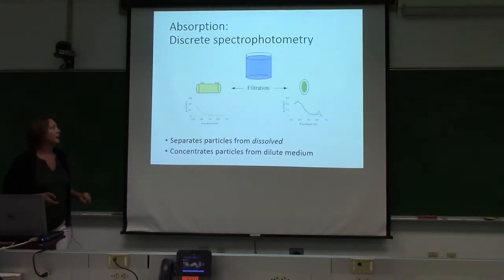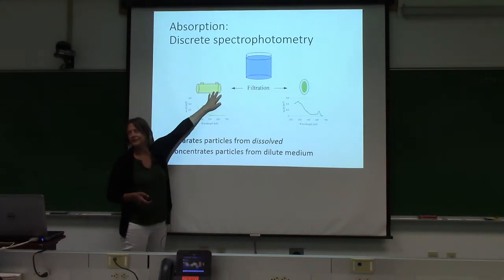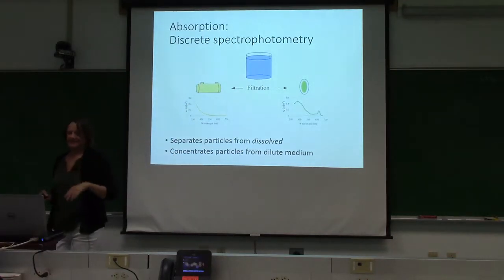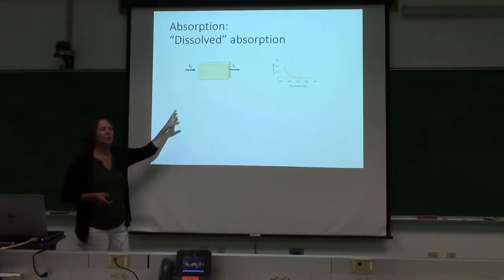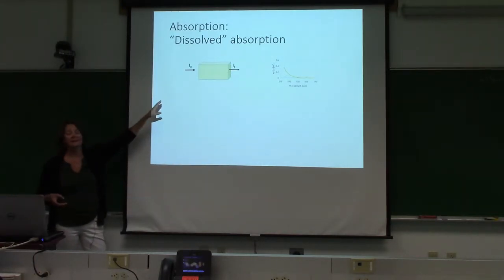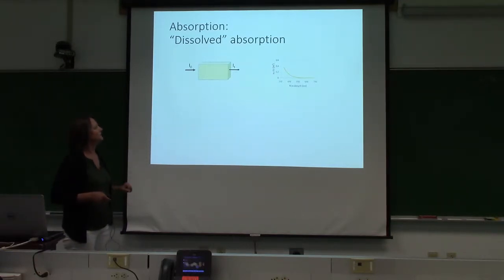Okay, so I was showing you these round cuvettes. Has anyone worked with these round cuvettes in a spectrophotometer? Yeah, they're a pain, right? You can never get the bubble out of this little corner right here. Yeah, and then it's just a hassle. So we will be using square cuvettes. If you are going to be moving yourself into spectrophotometry, I highly recommend the square cuvettes because you just don't have the same hassle of measurement as the round ones.